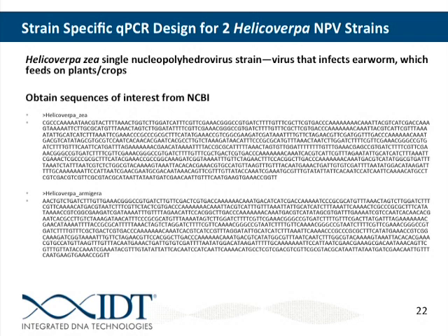So similarly to before, we go to Clustal, and we input each of our sequences into Clustal and obtain the alignment. And then we can look at that alignment to try to find regions that are similar and different. So in this case, we can see some gaps, and this looks like it's a good region to design to.